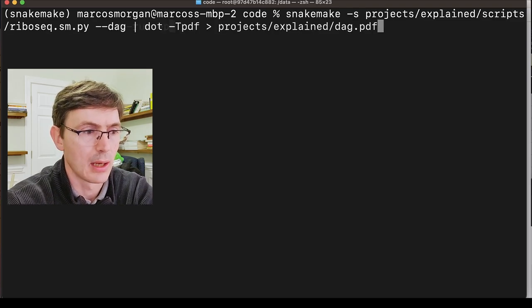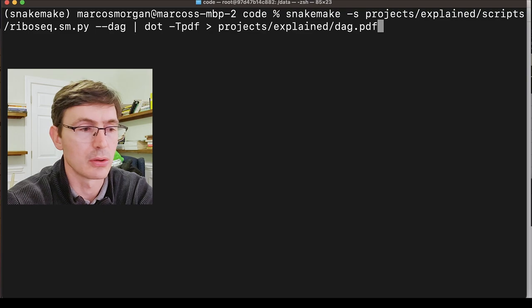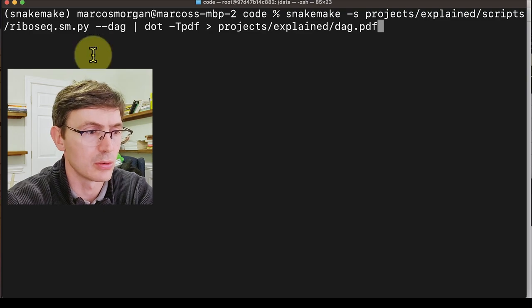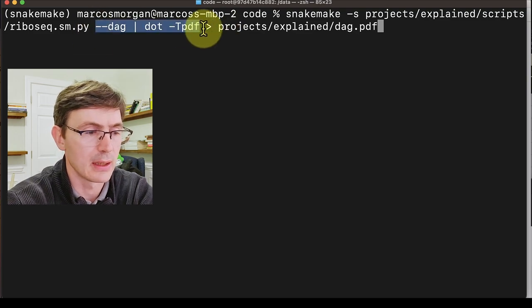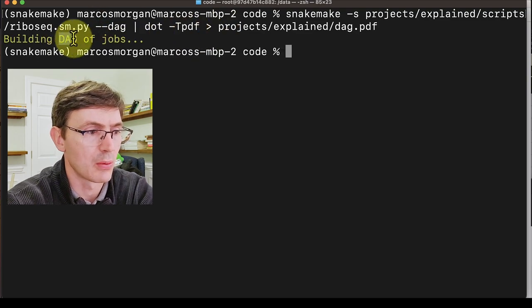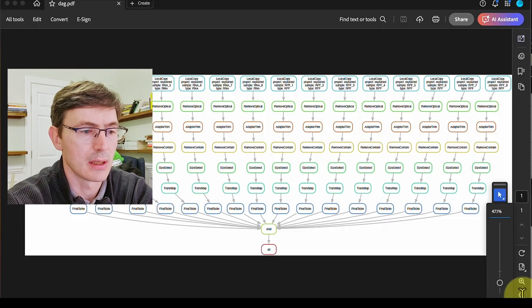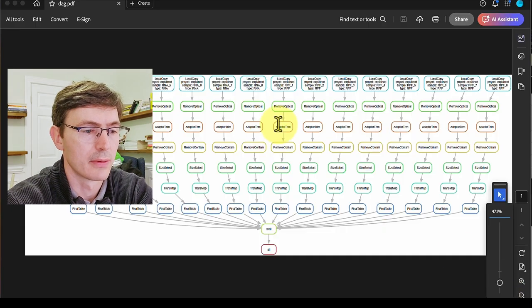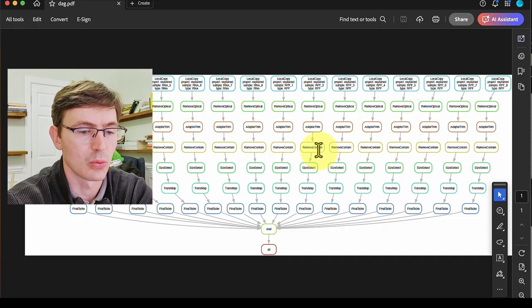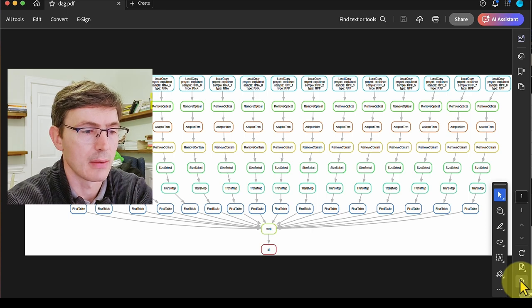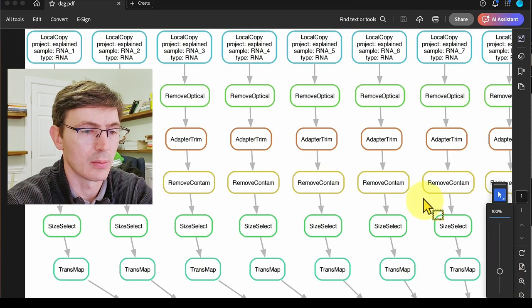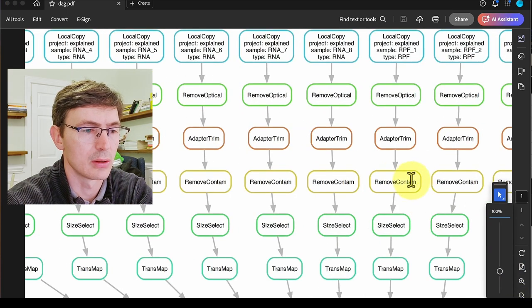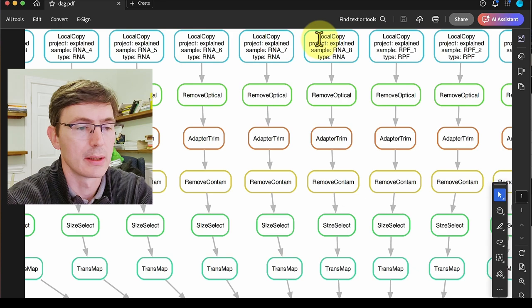So before we go into the details of the code, let's take a minute and look at the different jobs that we are going to launch. We are going to do that with this line here that will generate our graph. So this is the graph of jobs that we are going to execute. Each box is one job.